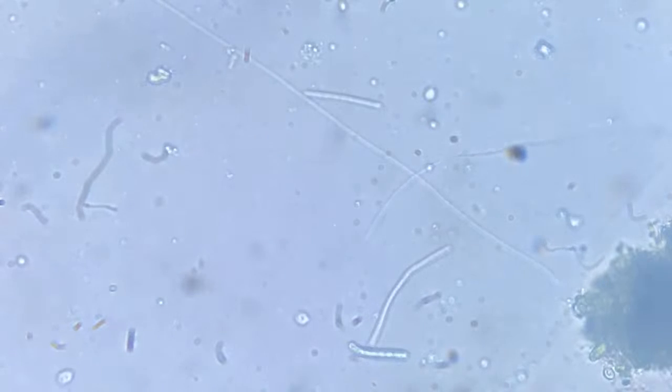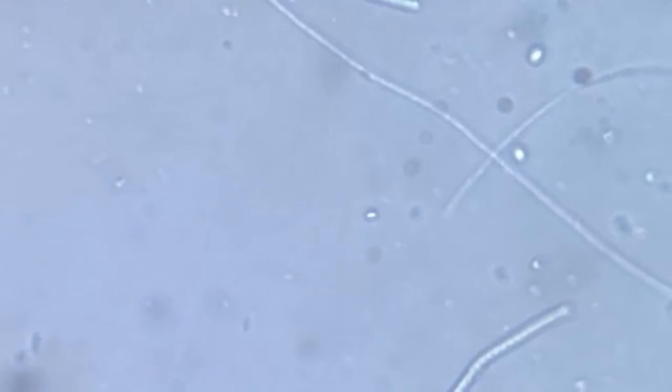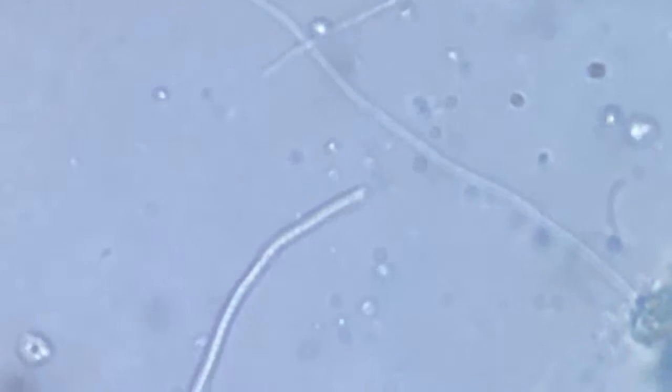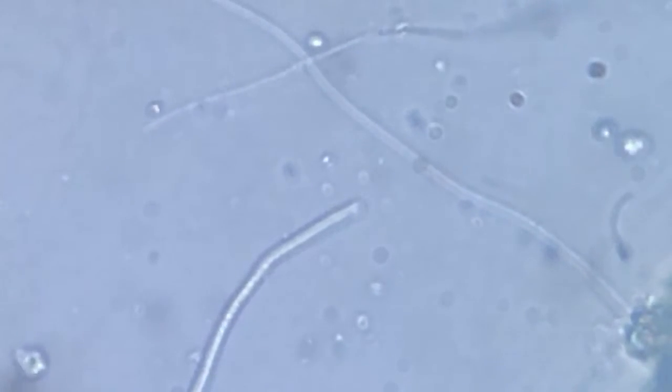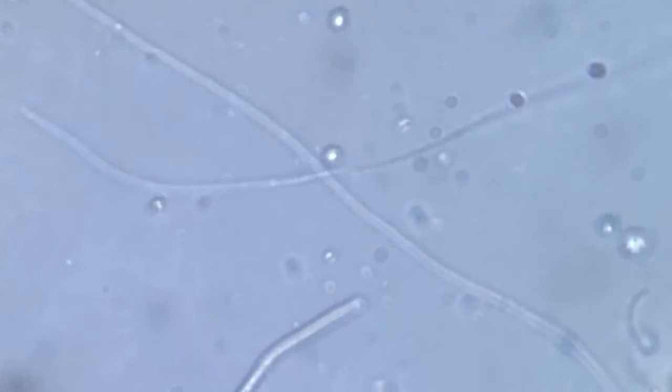We don't see any specific structures at the base or the end part. There are no specializations. Okay, so now they are rubbing over each other.